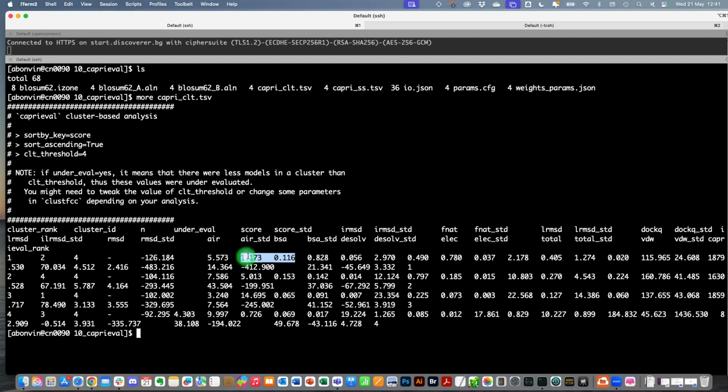So you see model 1 is at a 1.1 interface RMSD. The second one is at 5. The third cluster is at 14, so that's a very different solution. And the last one is at 10. Okay, the columns are not aligned here. So actually the ranking works very well because the best model is put on top. But we can only say that because we know the answer.